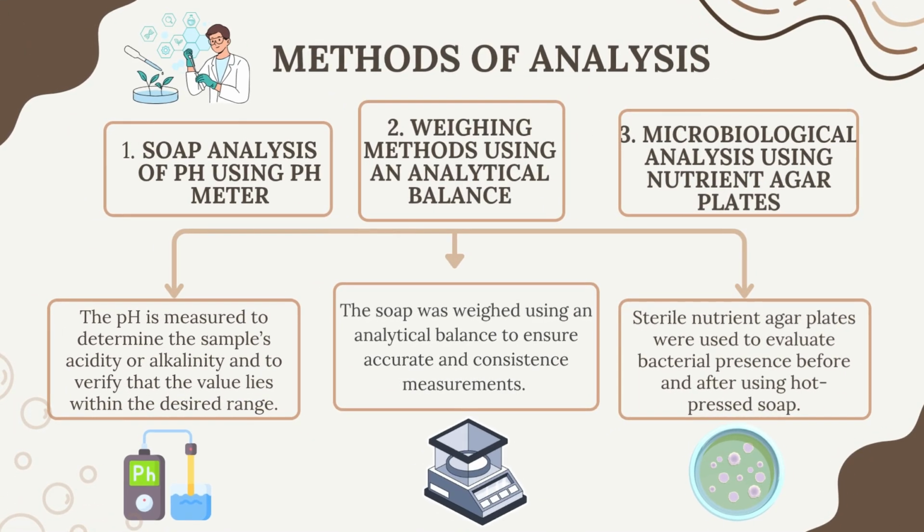Methods of analysis. The methods of analysis used for this experiment are soap analysis of pH using a pH meter, weighing method using an analytical balance, and microbiological analysis using nutrient agar plates.